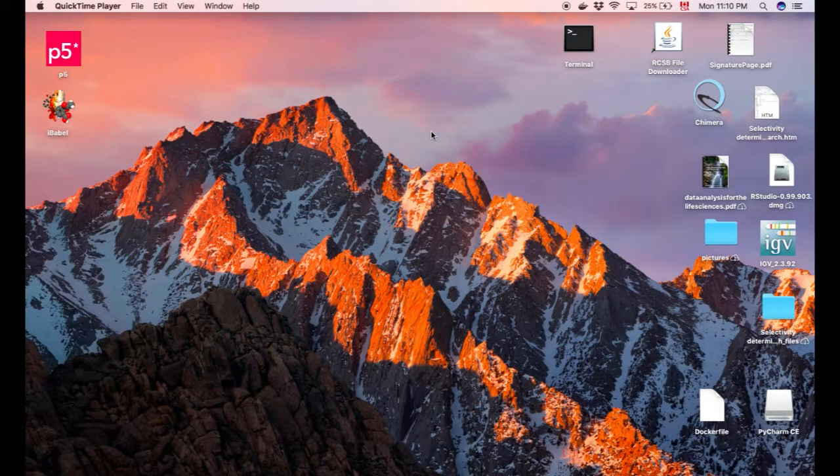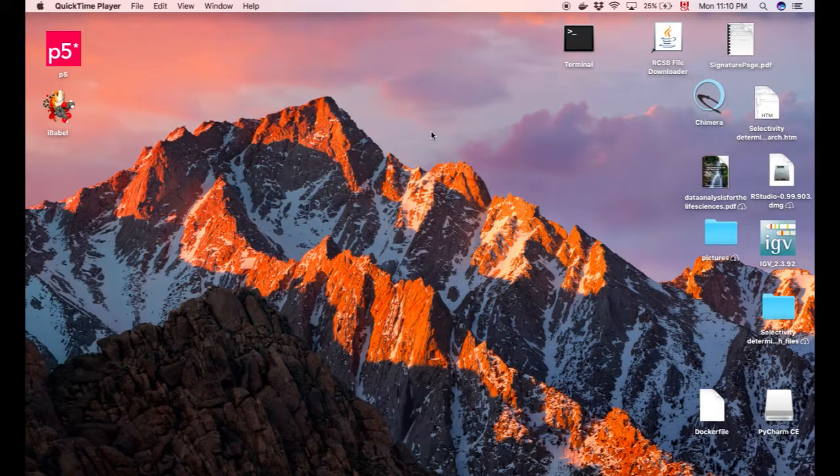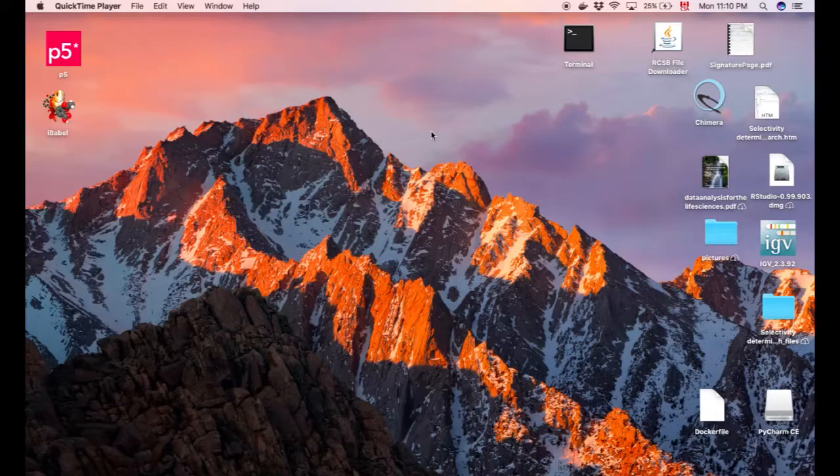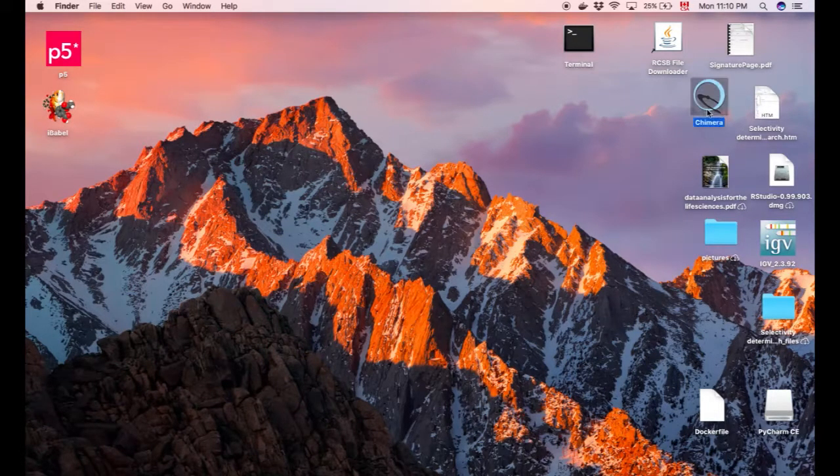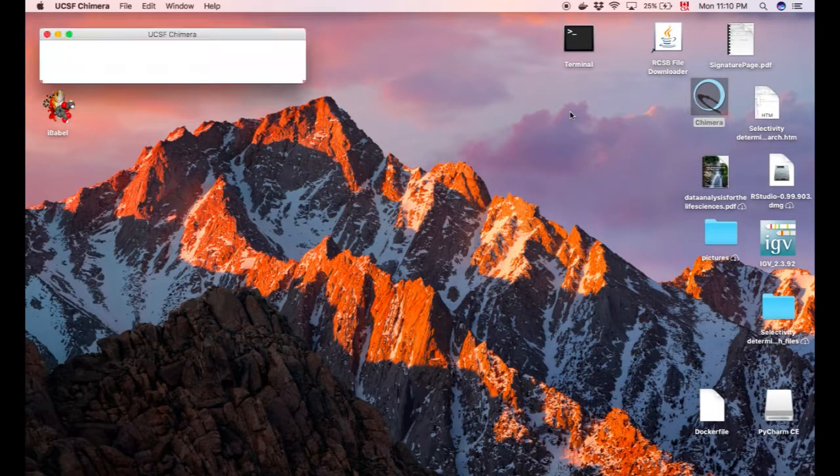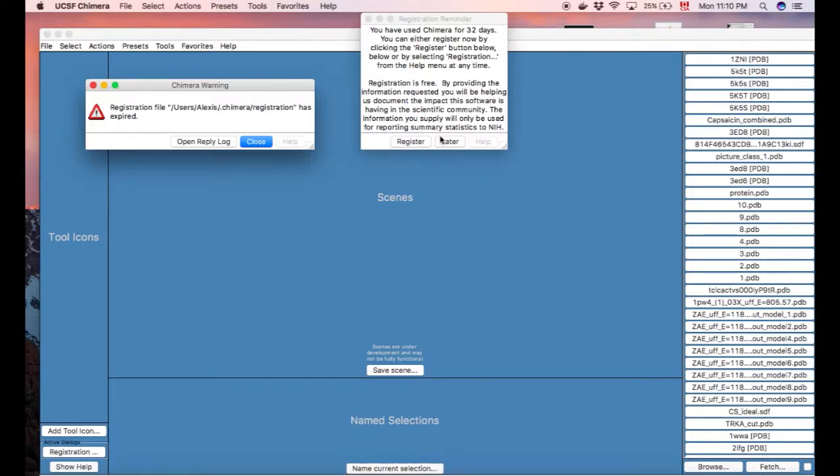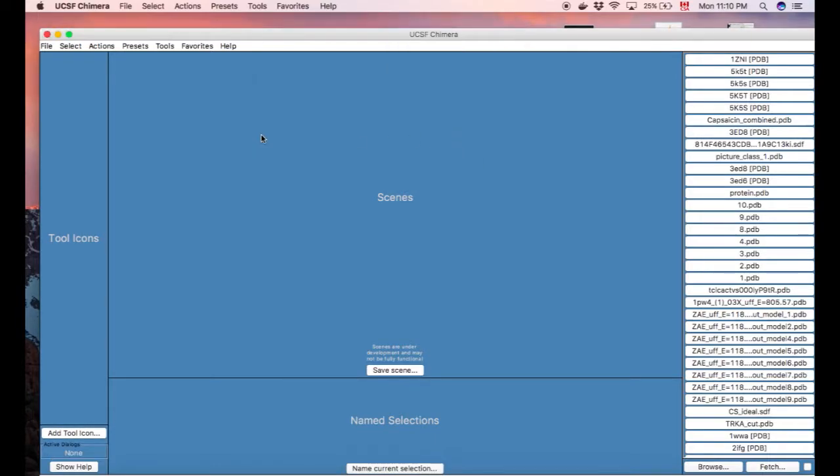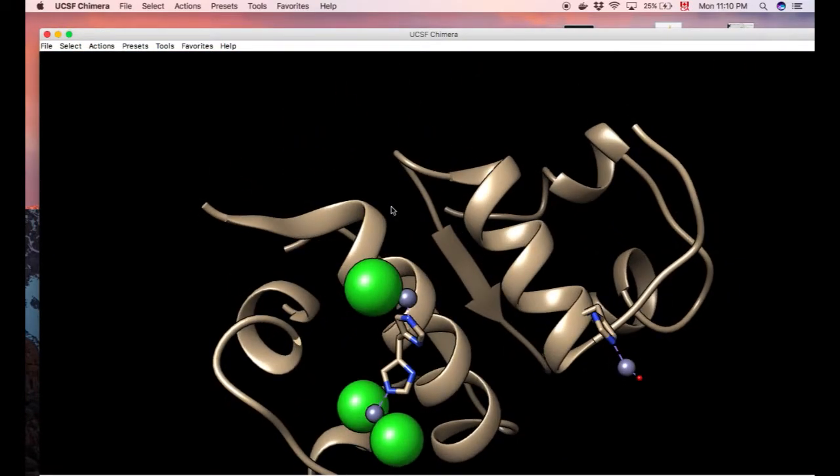Alexei once again with part four of protein imaging series. So today we're going to keep on going with UCSF Chimera's tools to basically continue analyzing a little insulin right here.